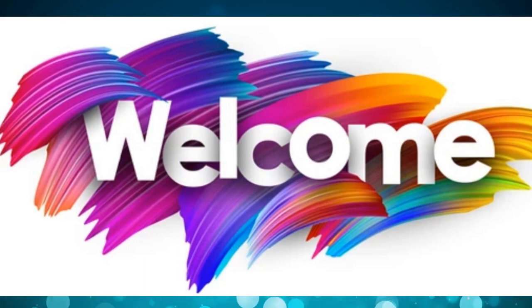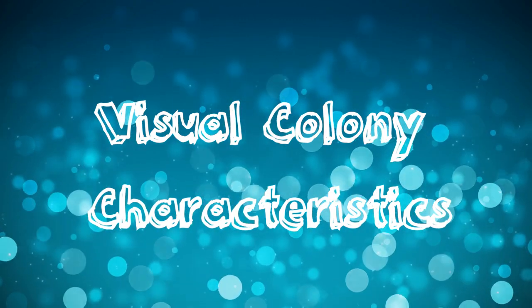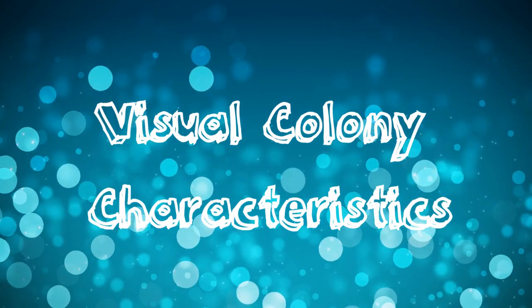Hello, welcome back. In this video, we will learn a more practical way of using the visual colony characteristics that actually help the microbiologist to narrow down the possible pathogens to a limited few.